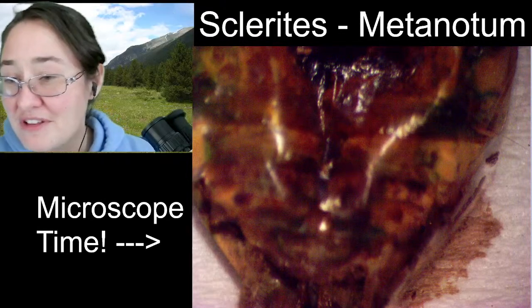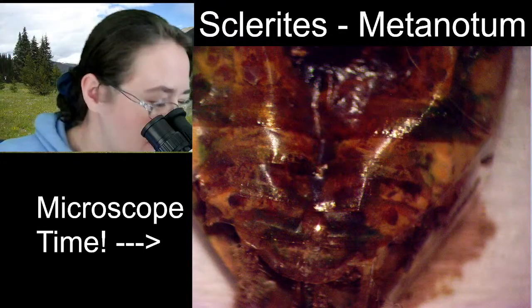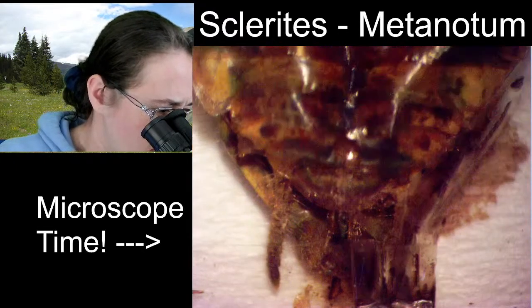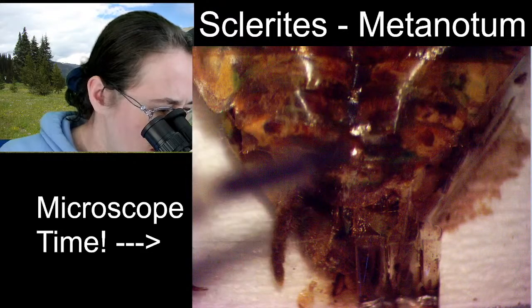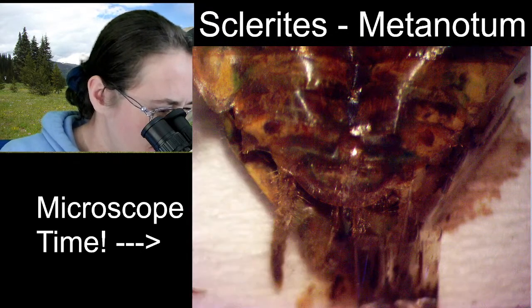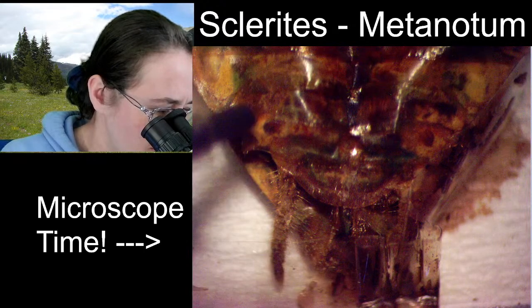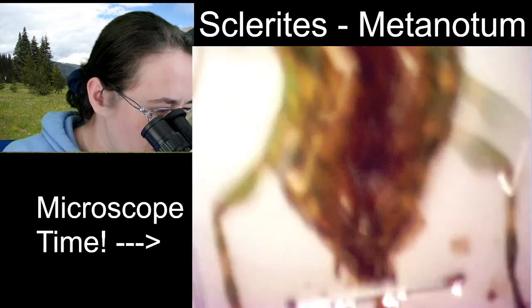Right, it's definitely a female because it has all of these extra segments here at the very, very end of the abdomen. So I originally thought it was 8 because from afar this all looked like one segment, but I'm seeing that it is actually 3 segments. There are 11 here, but the last 3 are equivalent to 1.